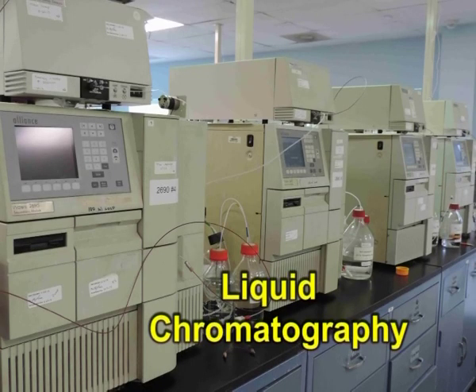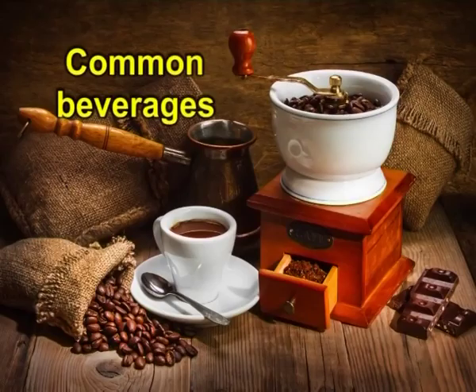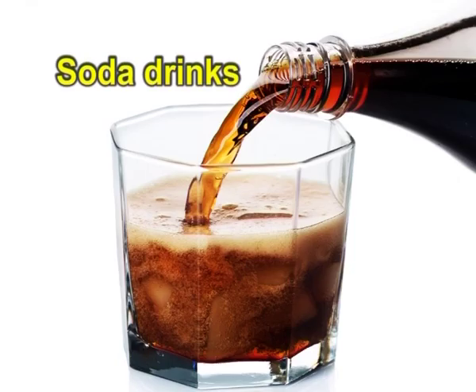A wide variety of methods have been employed, with high pressure liquid chromatography being the method of choice in many analytical studies, as it is commonly subject to fewer interferences than alternative methods. HPLC is an expensive and laborious technique that is not typically found in the scientific teaching labs of schools and colleges. Therefore, in this application note, an alternative analytical method that uses UV spectroscopy will be investigated to analyze and quantify the caffeine content of some common beverages and soda drinks.